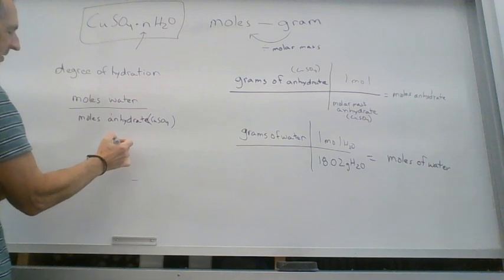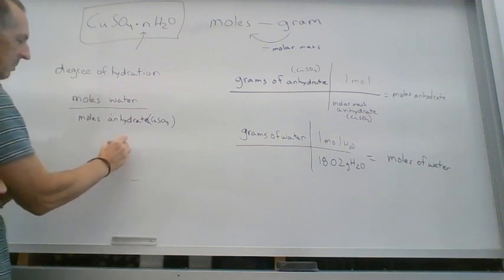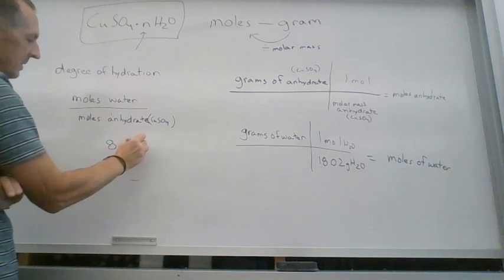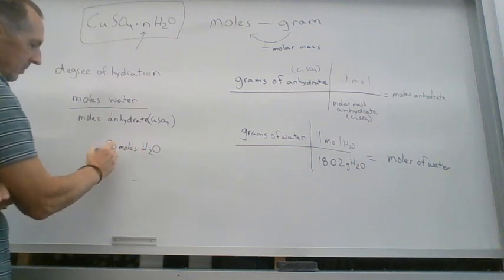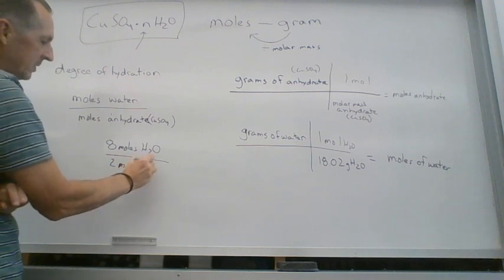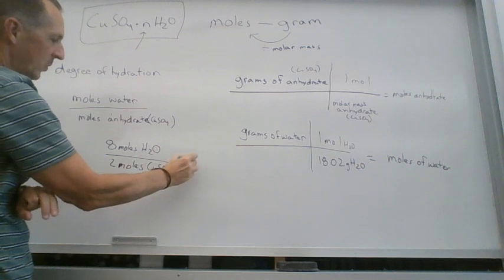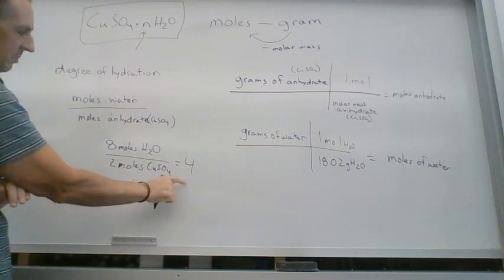And let's say, for example, that we had 8 moles of water and we had 2 moles of copper sulfate. That ratio would be 4. Our degree of hydration would be 4.